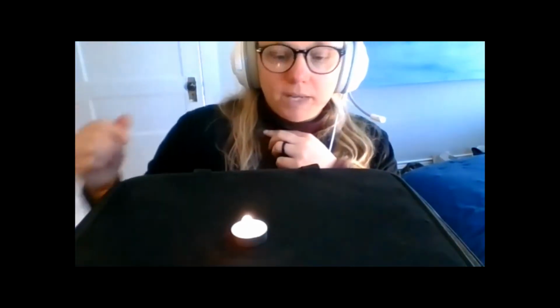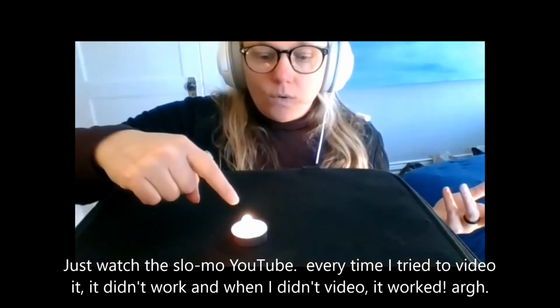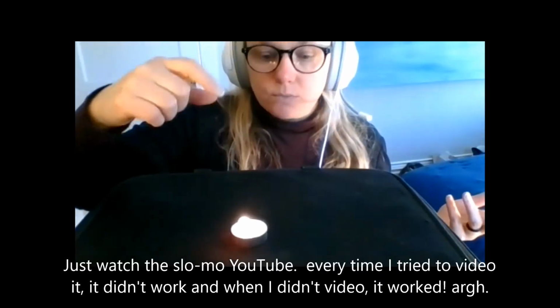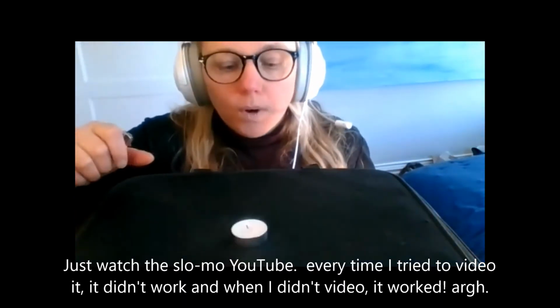The wick is pulling up the liquid, and it is turning into a gas, and the gas is igniting with the oxygen in the air, and then we have that little flame. Where the reaction is happening is in the flame. The flame is where the wax is reacting with the oxygen. And now there's a really awesome slow motion video that I linked in the instructions. I'd say go look at that, but I'm going to just show you quickly that what's actually burning is not the solid wax or the liquid wax. What we're actually burning is the gas, and we can actually see it if we put it out.